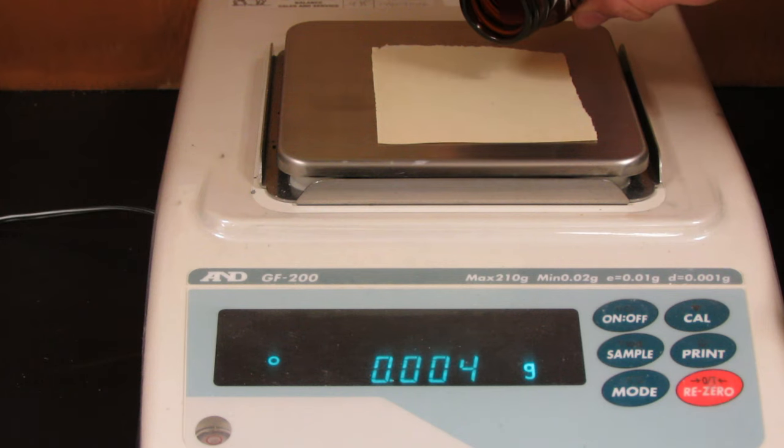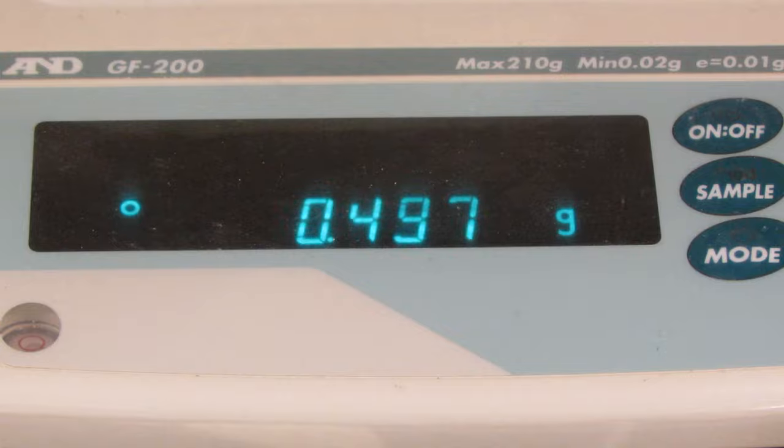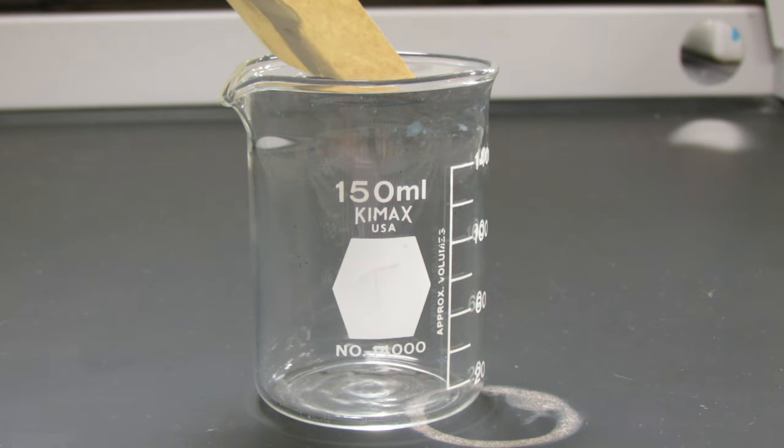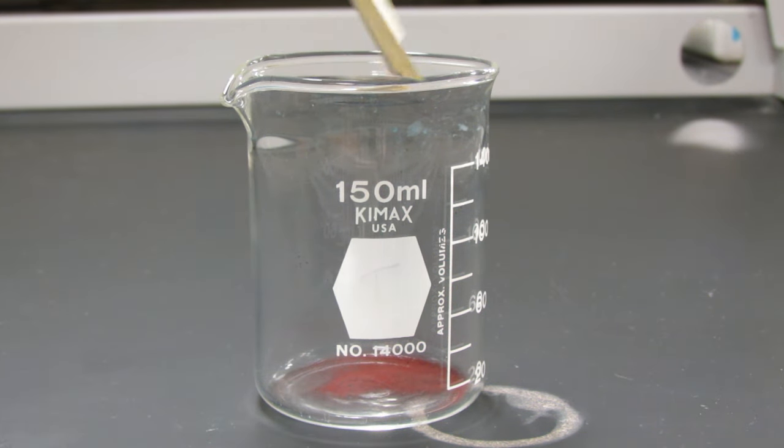Now it's time to actually perform the experiment. First, weigh out half of a gram of copper powder and put it into a 150 milliliter beaker.